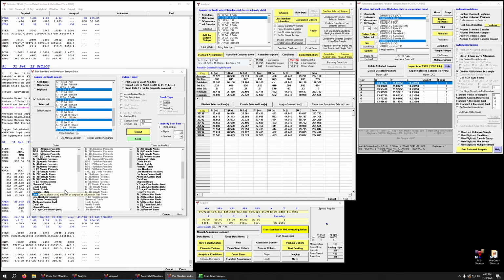So now in our plot, we're going to do on beam current. That's the Faraday cup measurement before the analysis. And we're going to go down here to raw K ratios. Now I'm going to show them all at once here for all 4 spectrometers I did titanium on. I would recommend probably doing them one at a time when you're doing this yourself, just so you don't get confused and keep everything in line. But this way you can see what all 4 spectrometers are doing right now. And then I'll go through and show you how to change it if there is a problem.